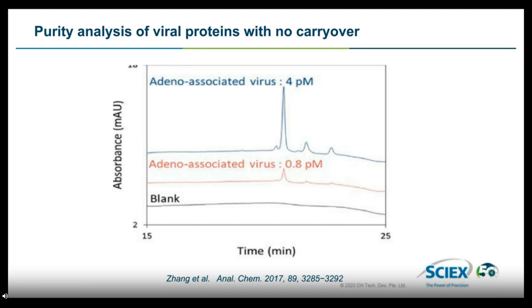And this is because the capillary is used as the injector as well as the separating column, and it doesn't have any connectors like you have in an LC analysis, where you have an injection valve which has connectors, LC connections to the column, for example, where carryover can happen.